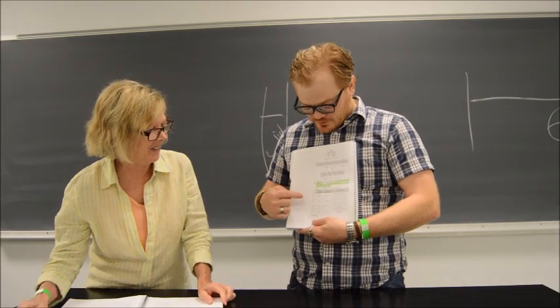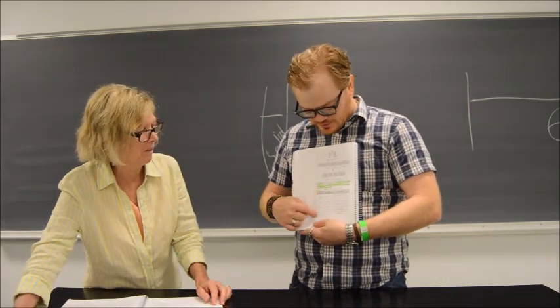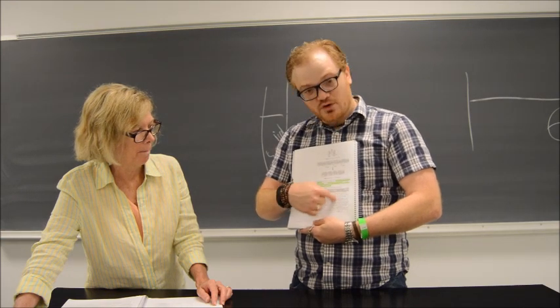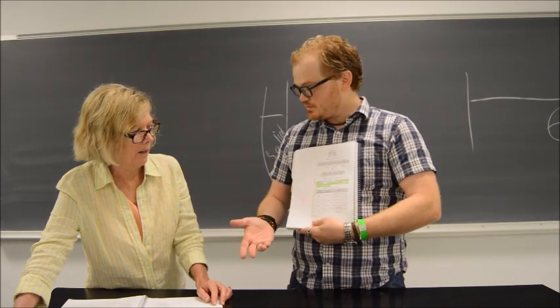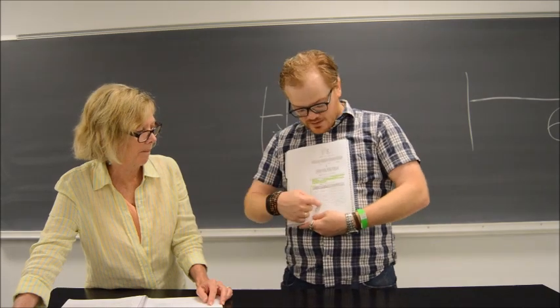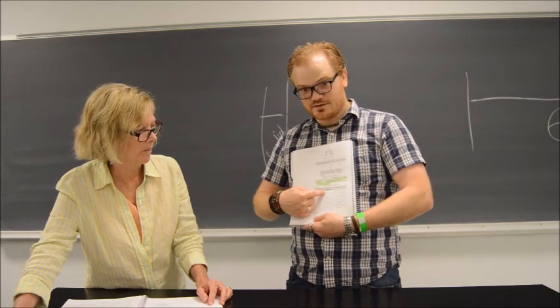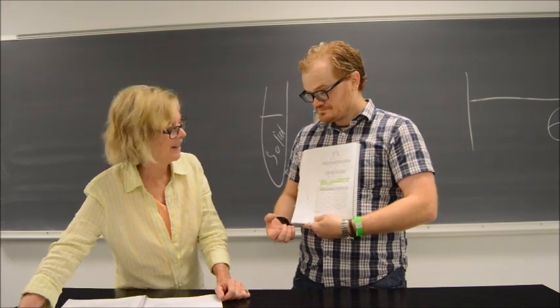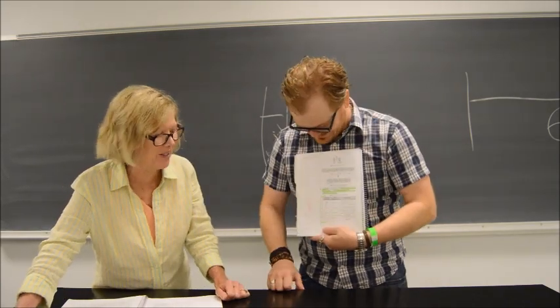What we have here is going to give you which macromolecule you're looking for, which test is utilized for that, and what the general outcome will be if those macromolecules are present. So this chart is very important. And obviously that means on your lab test, you're going to have to know this information.